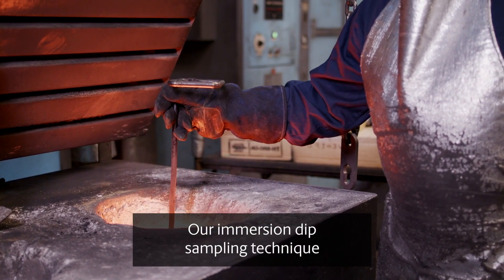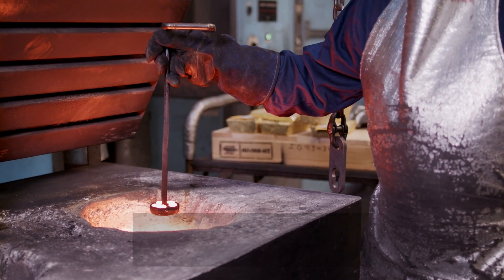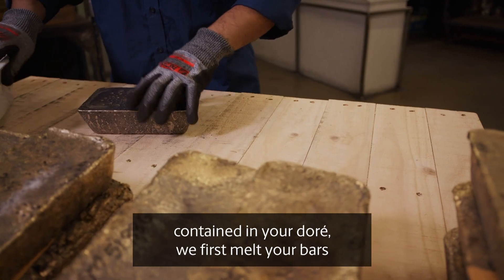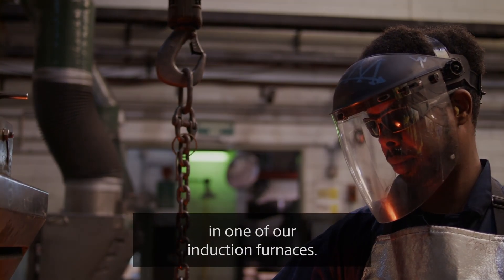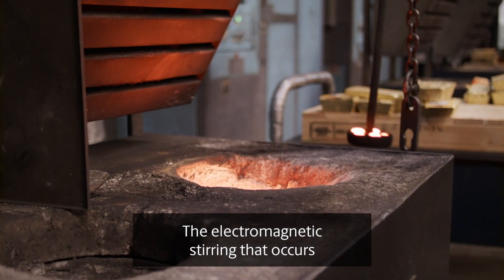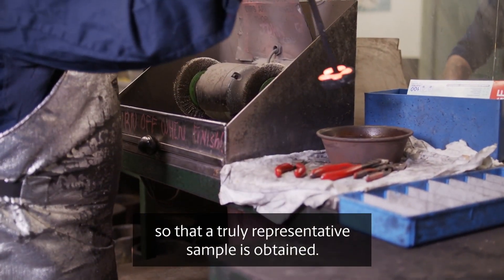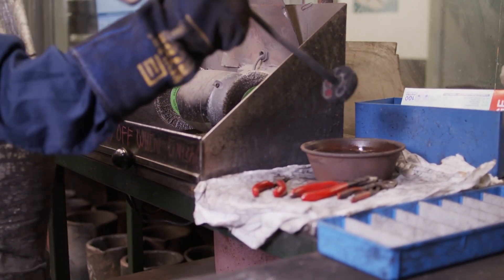Our immersion dip sampling technique takes gold from the centre of the furnace to ensure the best possible accuracy. To determine with certainty how much gold is contained in your doré, we first melt your bars in one of our induction furnaces. The electromagnetic stirring that occurs in these furnaces generates a uniform composition within the molten metal so that a truly representative sample is obtained.